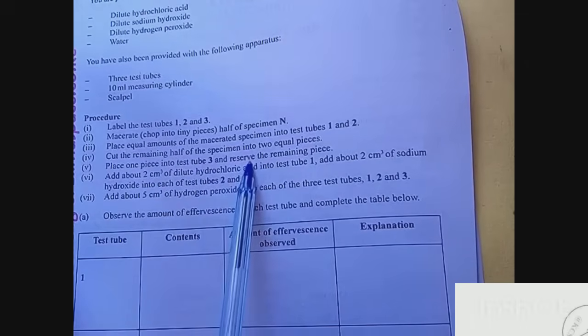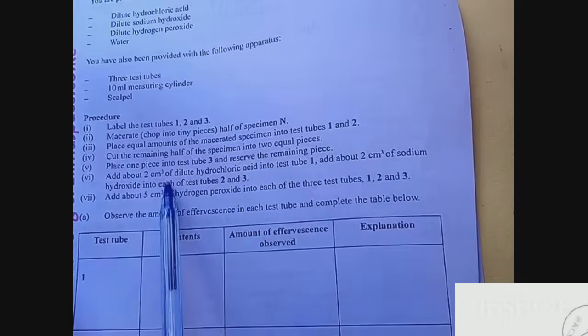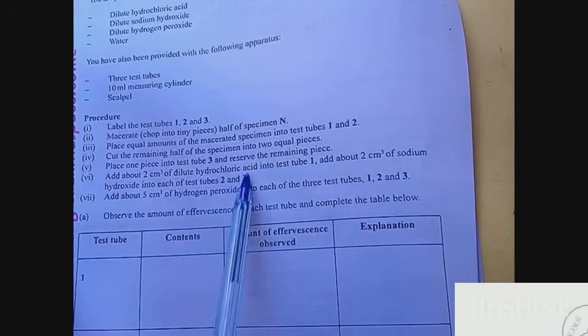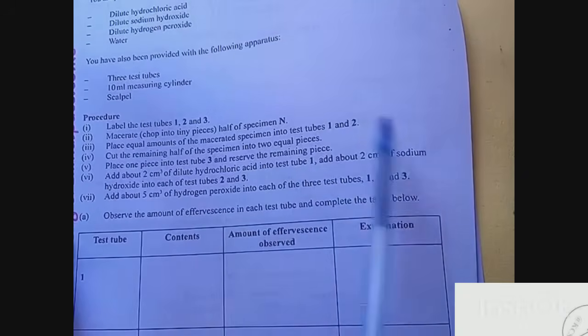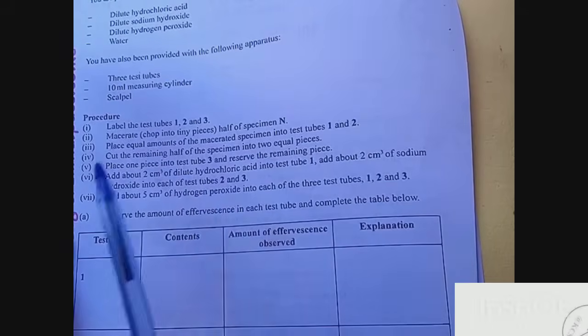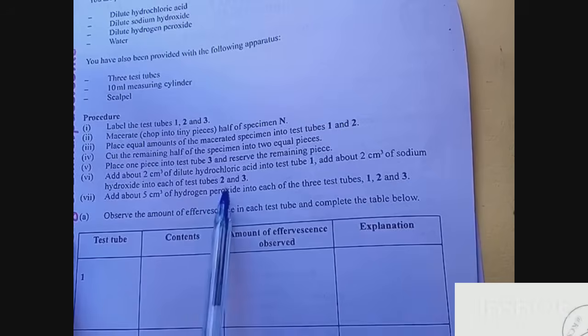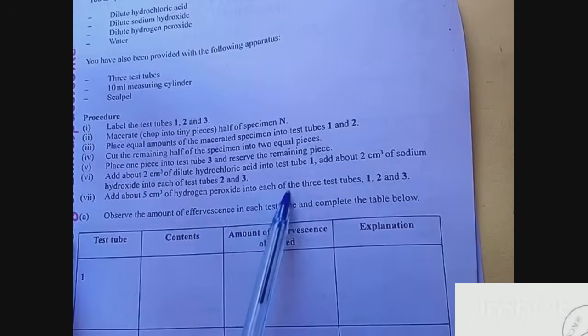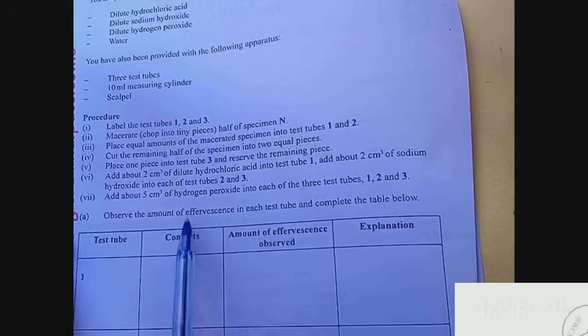Cut the remaining half of the specimen into two equal pieces. Place one into test tube three and reserve the remaining piece. Add about 2 cm³ of dilute hydrochloric acid into test tube one. Add about 2 cm³ of sodium hydroxide into each of test tubes two and three. Add about 5 cm³ of hydrogen peroxide into each of the three test tubes.